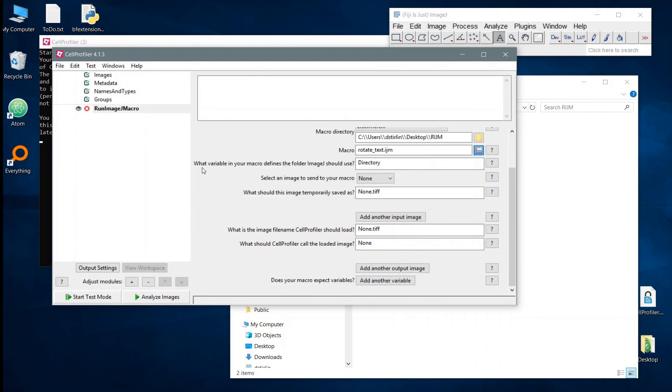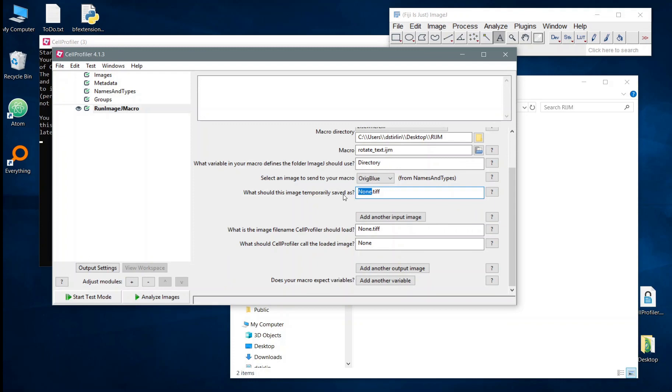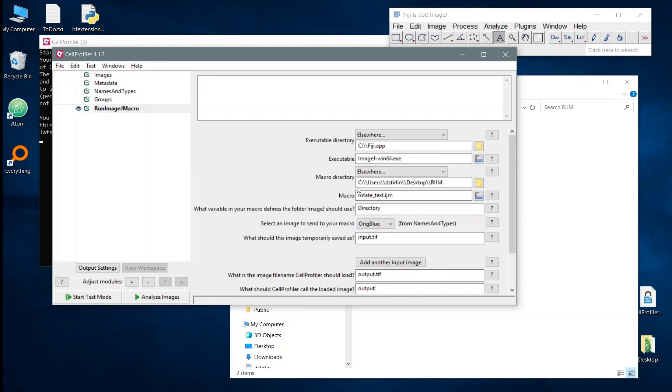So you'll see we have a few questions here. The most important one is which variable in the ImageJ macro is going to refer to the directory that we're using. But we also now have the option to send in say blue image and we have to say what the image should be saved as and what we will be loading up afterwards. So I believe in this macro it will be called input.tif with one f and output.tif and we'll just call that output.